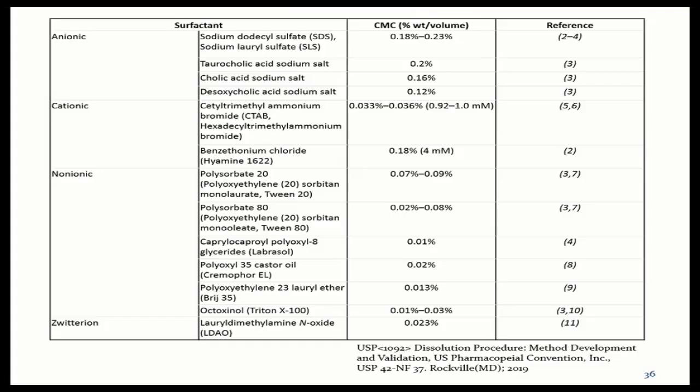I think the other one's probably the most prevalent, and you guys let me know what you think, but generally I've used CTAB, polysorbate 80, and yeah, I have had to use Triton X as well, but that probably comprises about 98% of what I've had to use.